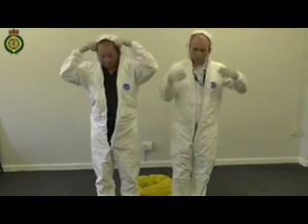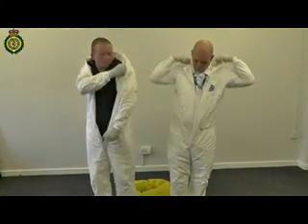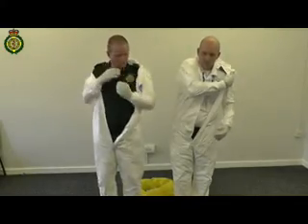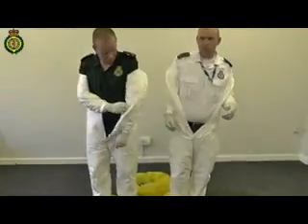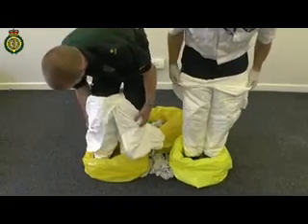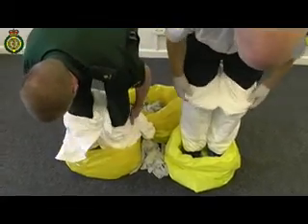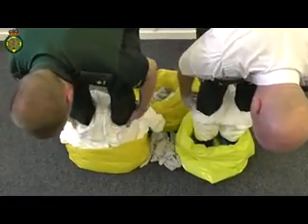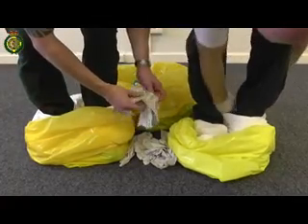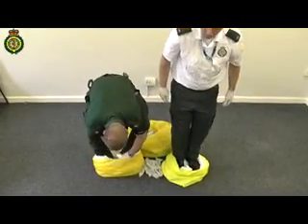Roll down the hood, only touching the inside of the overall. Continue to roll down the overall, down to your knees. Continue to ensure you only touch the inside. Roll down the rest of the overall. If both your pairs of gloves have come off at this point, put on one pair before continuing. Take off the boot covers and step out of the bag.